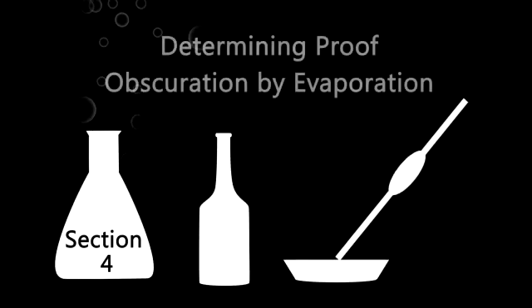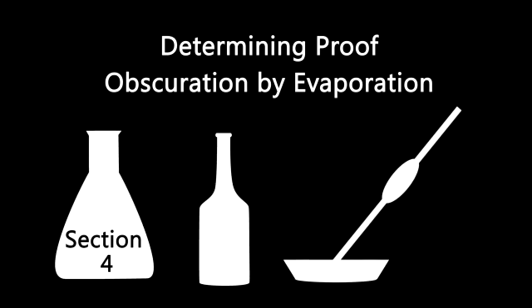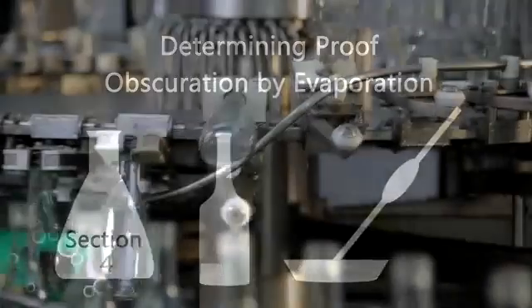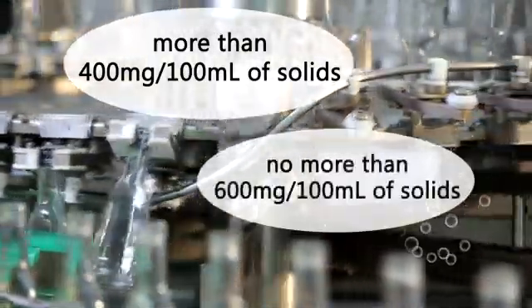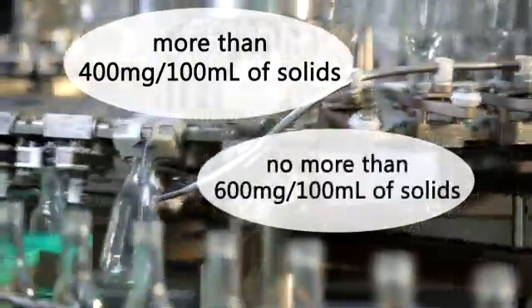Let's look at how to determine proof obscuration by evaporation. If your spirit contains more than 400, but not more than 600 milligrams of solids per 100 milliliters of spirits, you must determine true proof.